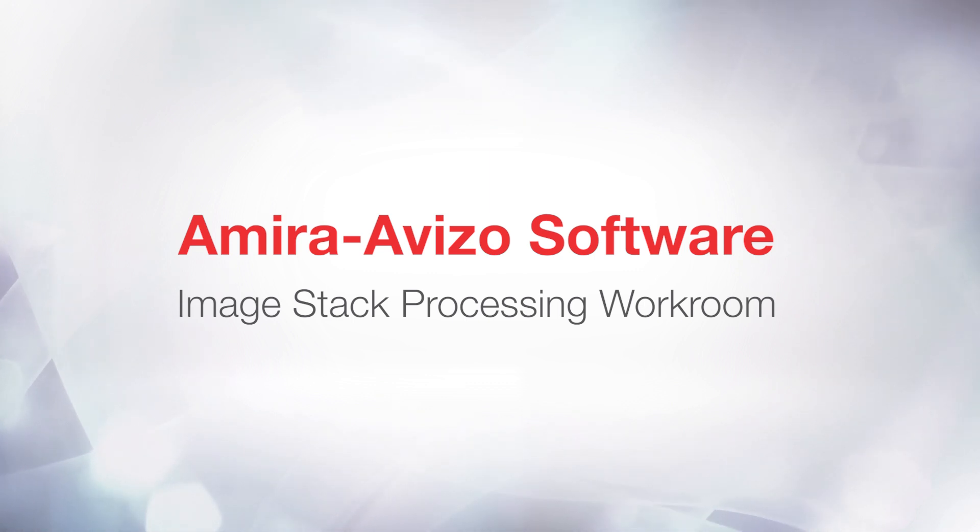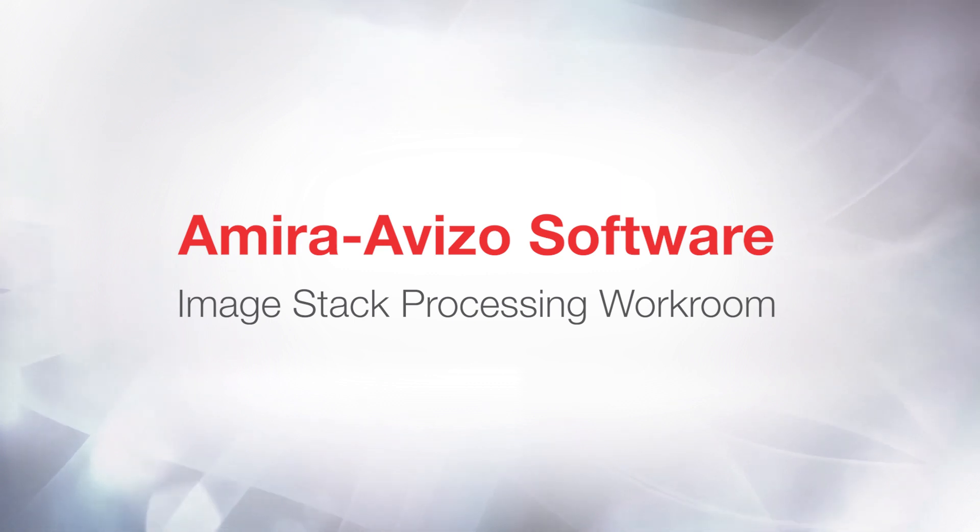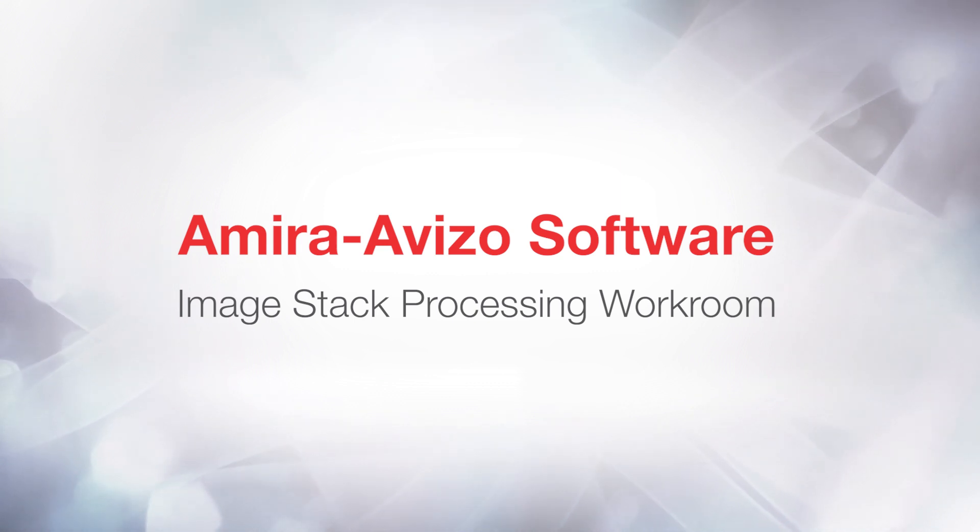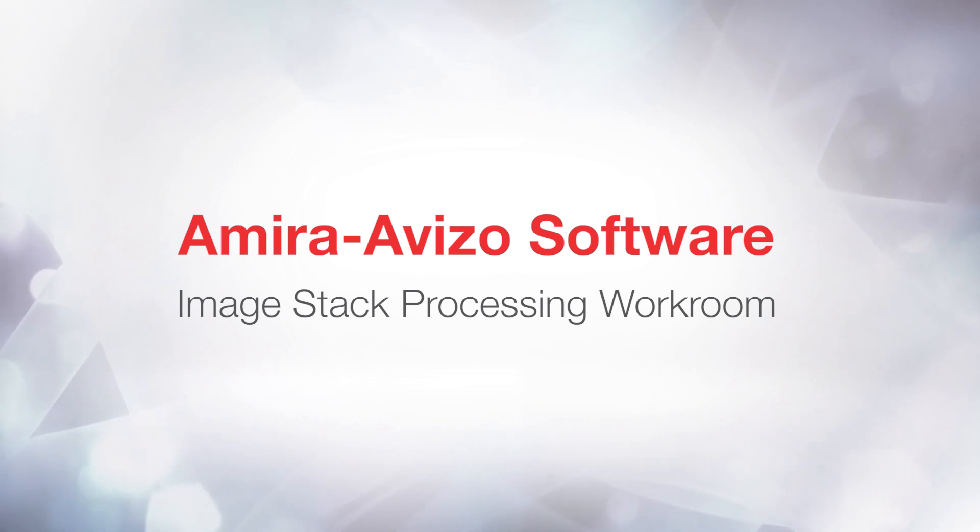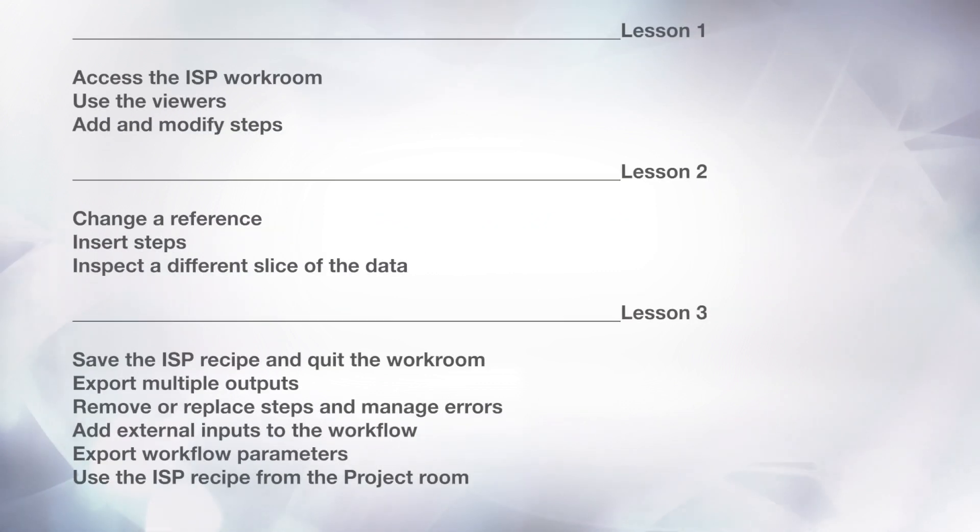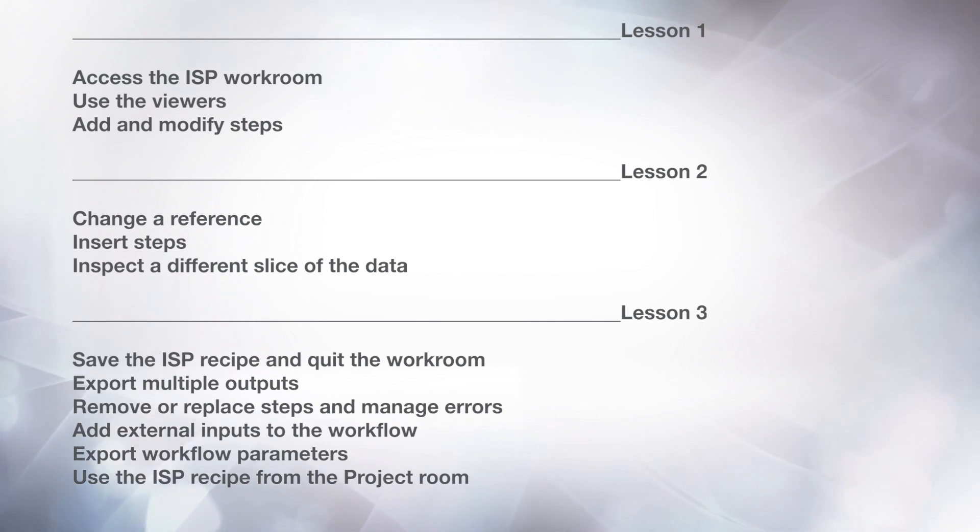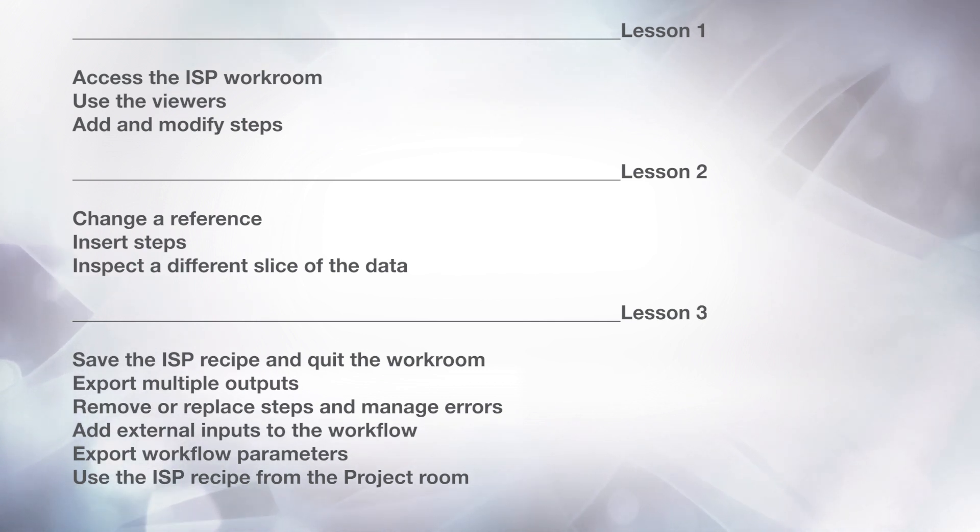The Image Stack Processing module allows the creation and execution of image processing recipes to process an image stack in 2D, meaning that each image of the stack is processed individually. The Image Stack Processing Editing Workroom features an interactive and dynamic editing environment, giving constant feedback about the recipe being built.